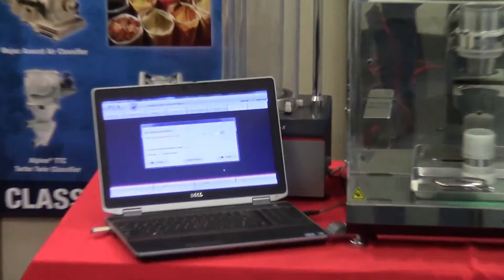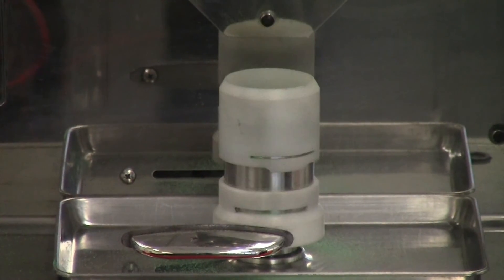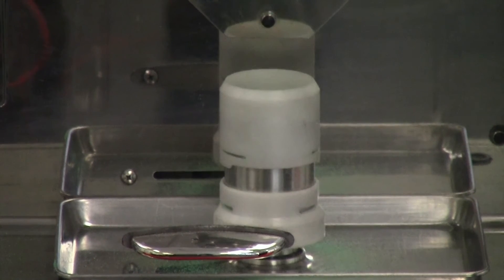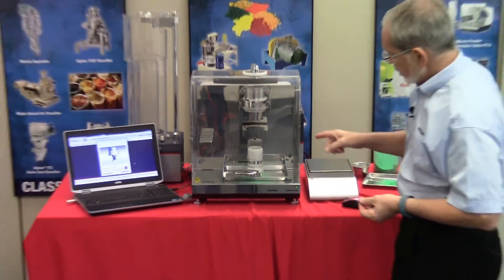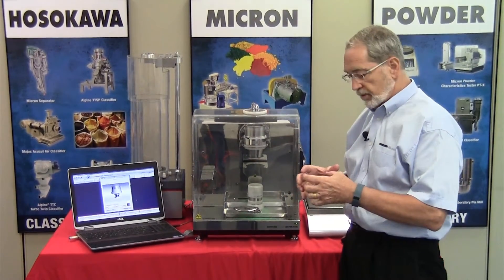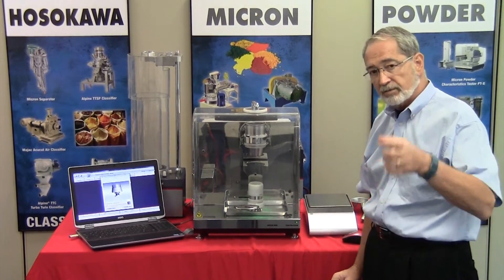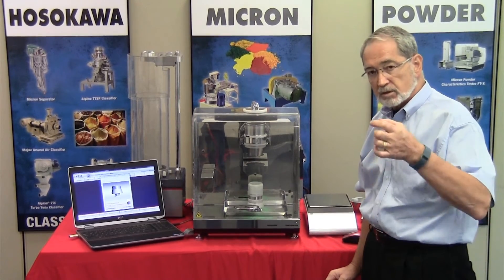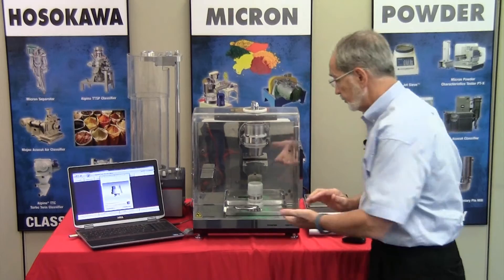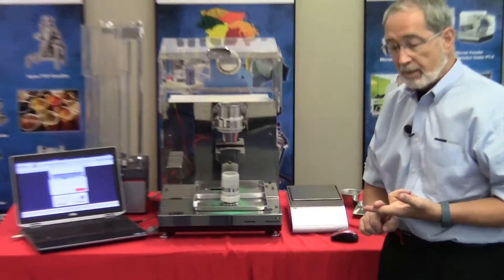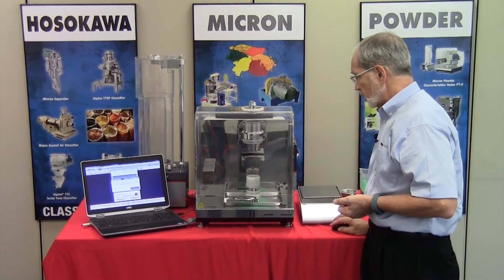Now that the cup is filled, we press start to begin the tapping sequence. This will tap for the full 180 taps, compressing the product within the vessel. The key is to confirm periodically that the material is not passing below the edge of the stainless steel cup, since we're working off a defined volume of 100 cc or 100 ml. If the material drops beneath the cup level, open the cover — the tapping stops — add more material, re-close the cover, and begin tapping again.